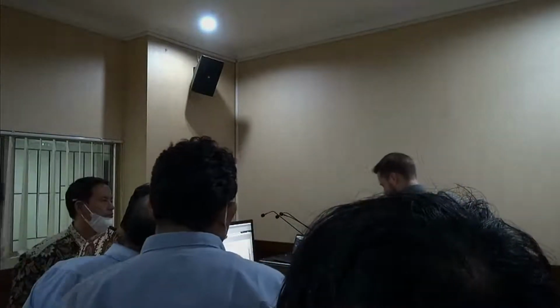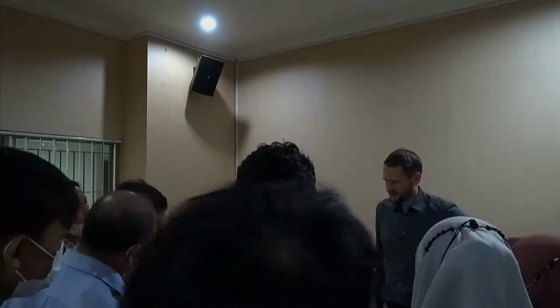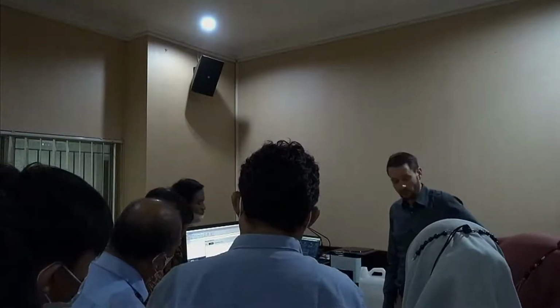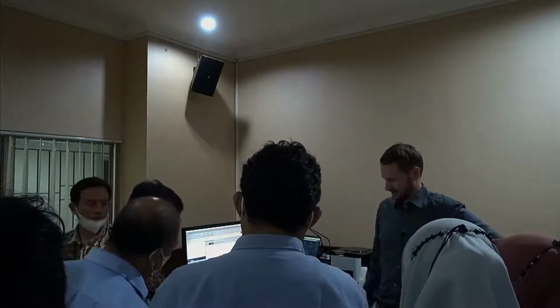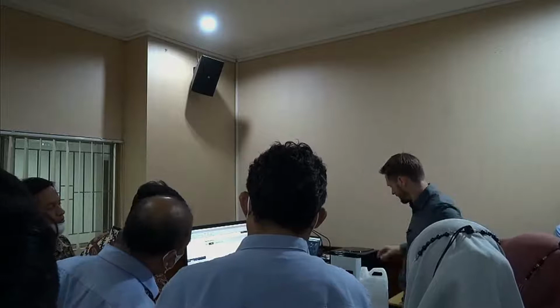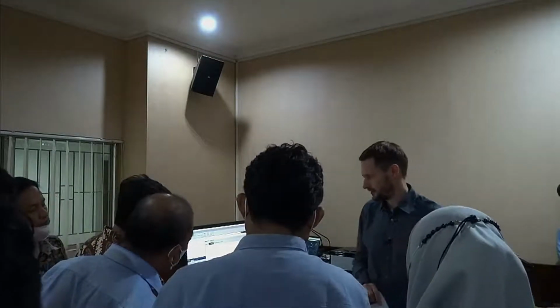So there was a countdown. I don't know if you saw it on the lower left, which you can preset in the SOP. I think the standard setting is 30 seconds. In case you need more dispersion time to stabilize, you can, of course, also increase this. So we are doing 3 measurements here, each 10 seconds. First one is gone through. Second one will be in a matter of seconds. There's the second one. And the third one is running, which tells me I may get ready for the manual cleaning.